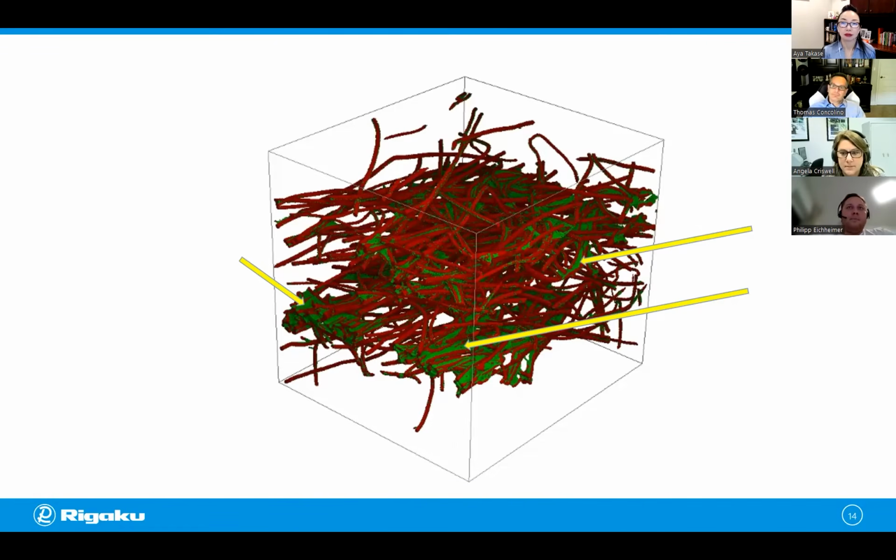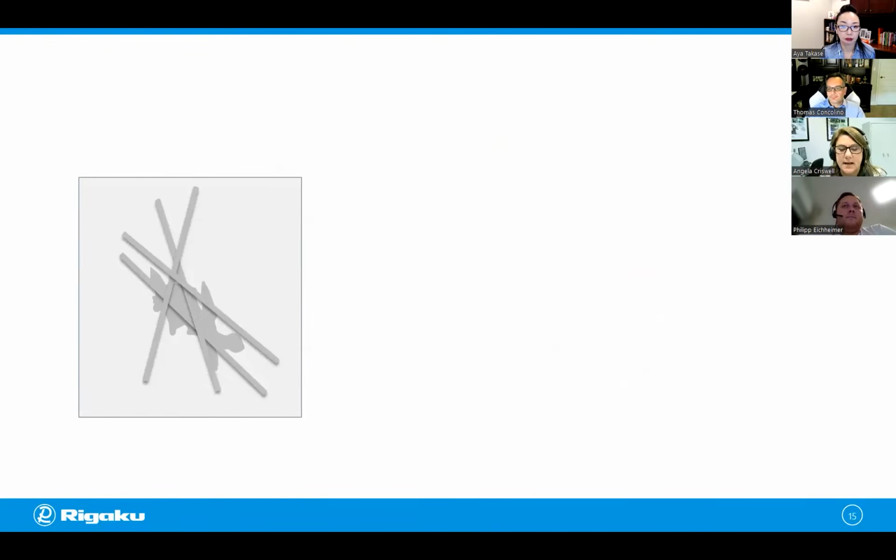All right. So on to the next one. That kind of leads us into the next step. We learn that not only do we have to segment everything, we have to identify which is which, so we have to label binder and fibers separately. But this process is complicated by the fact that the fibers and the binder often have the same gray levels in our CT data, so we can't separate these two phases using simple thresholding.